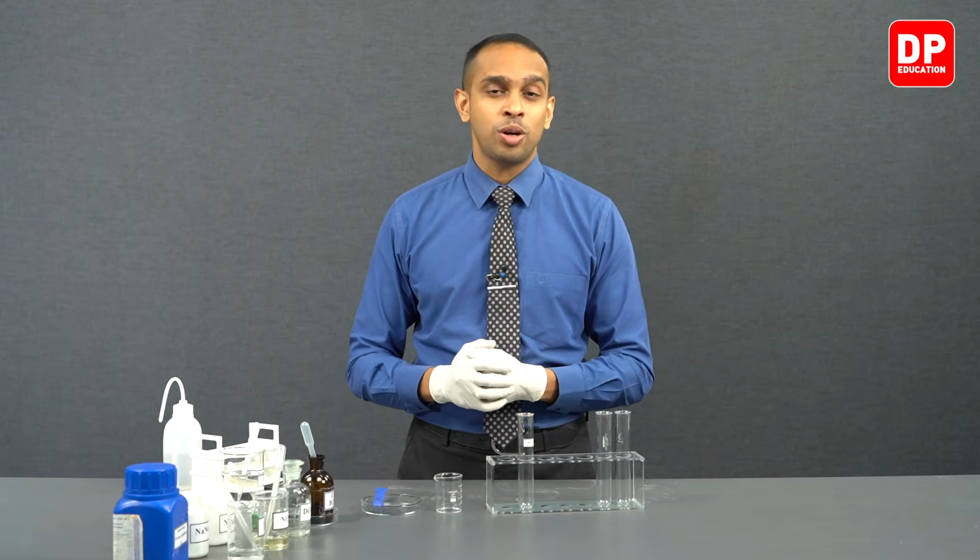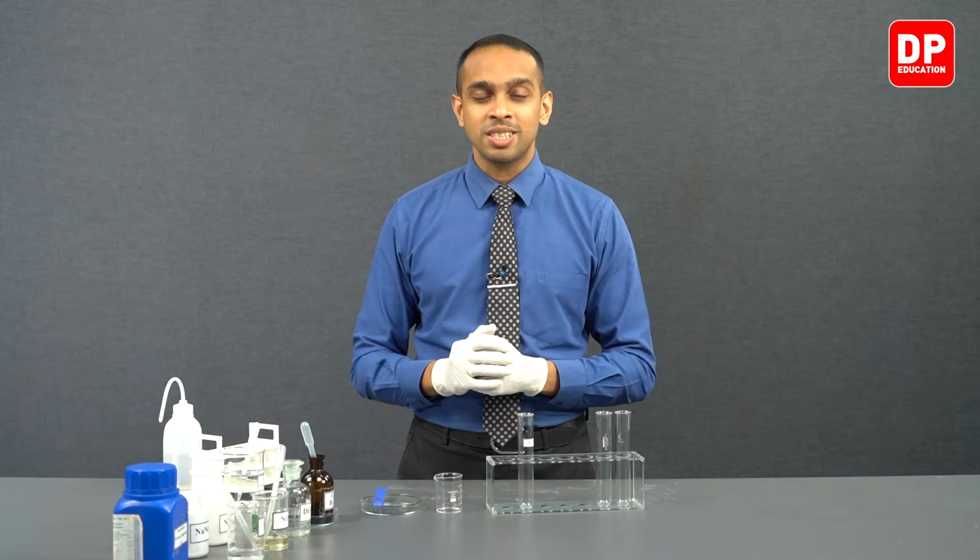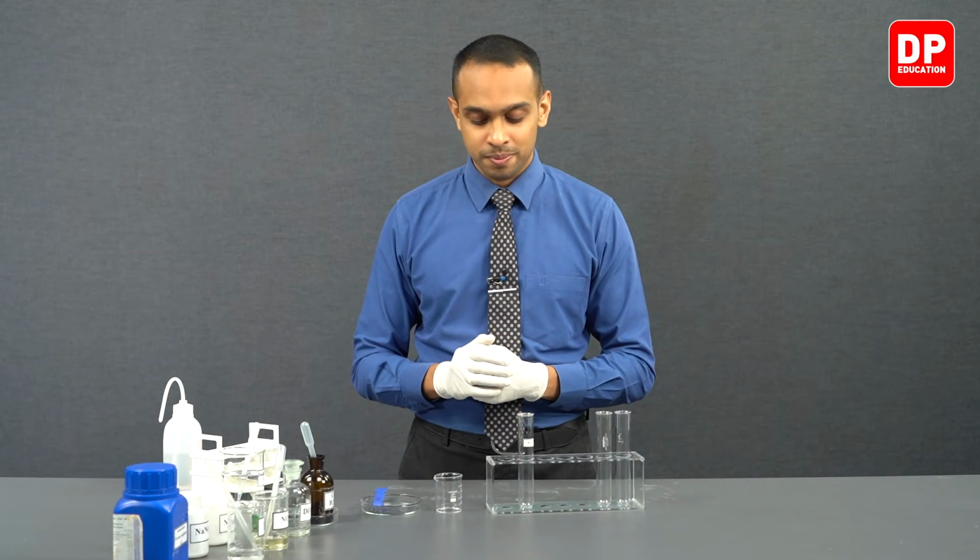So let's move on to this reaction and observe the formation of this brown ring.